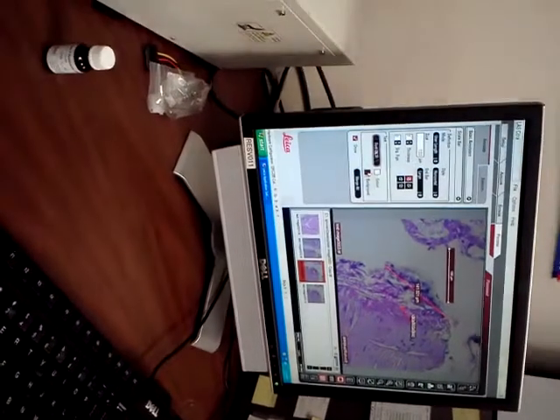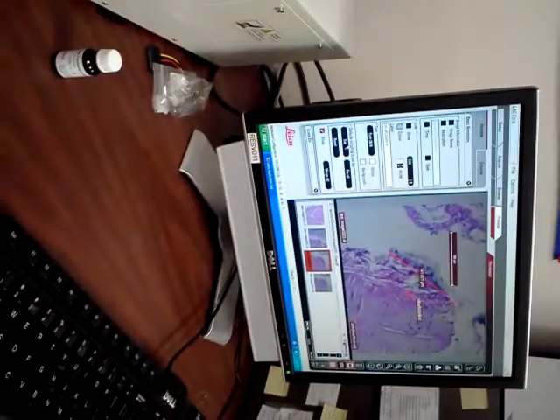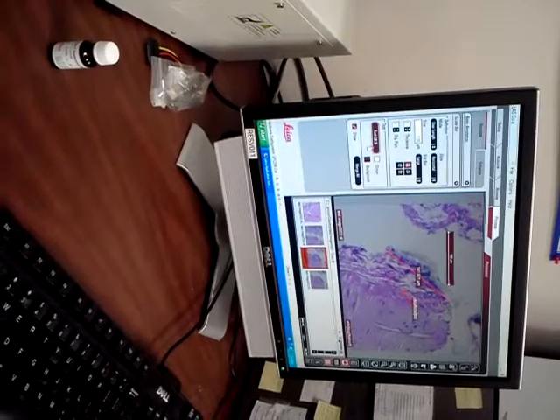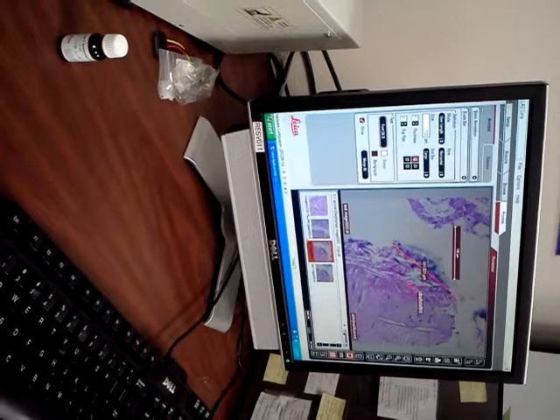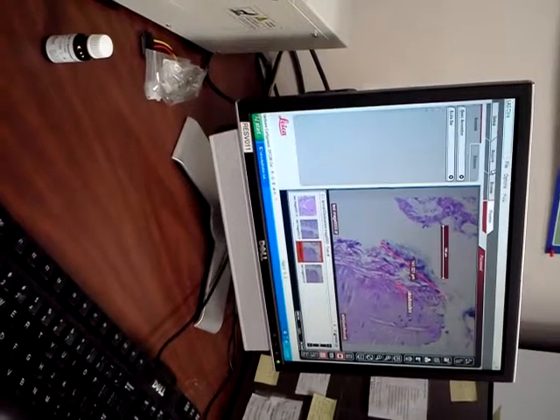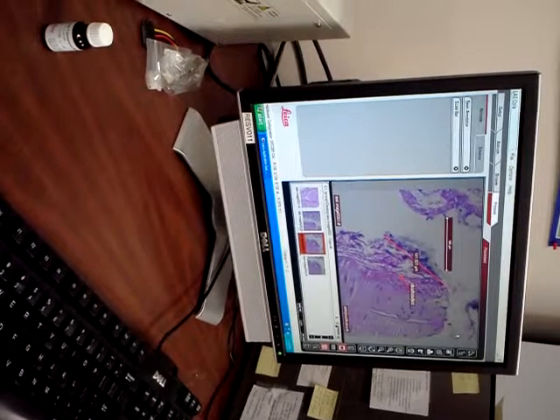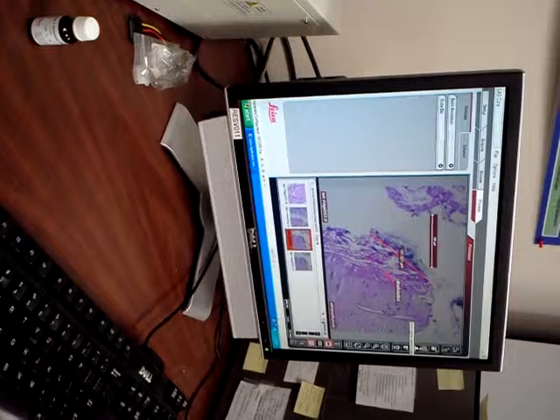And again, same as this. When you do that set, it's going to defaults including scale bar. So here and the scale bar drop down as well. And the merge all, again, it's going to merge both your scale bar and your annotation, so it'll do everything on the image. One other nice feature that is free with the software is the stitch function.